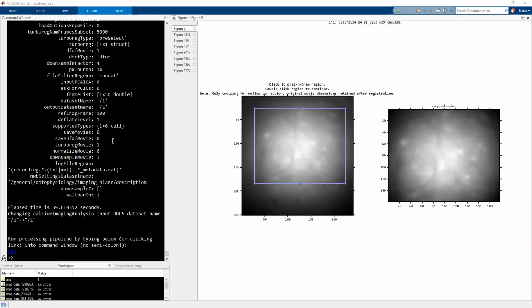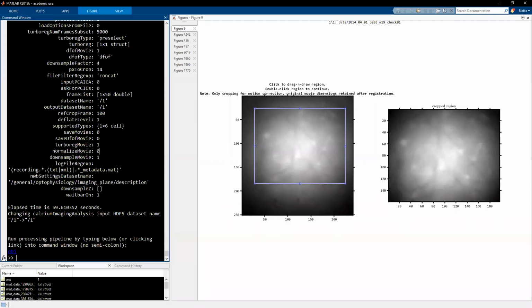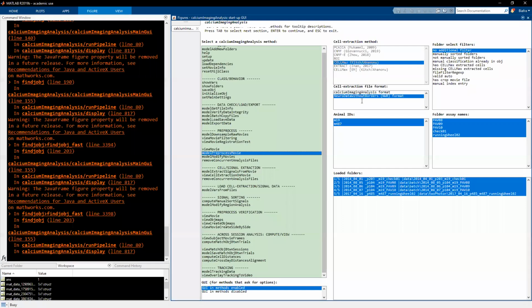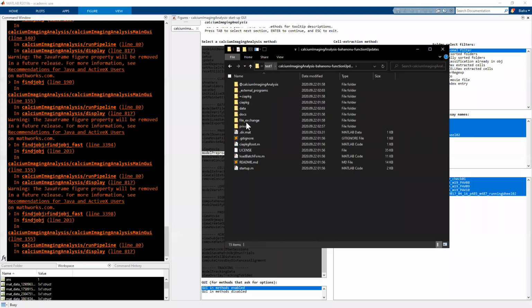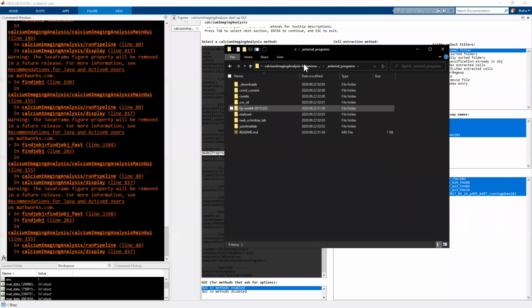Once you've run the pre-processing, what that looks like in terms of the actual output files is this: if you go in and look at the example folder files that you can download, they are put in the data folder. The way this is generally organized is that any of those external repos are all downloaded here. So if you need to modify or change something in those, you can look here, or the zip files will also be here if something goes wrong or is accidentally deleted. And then the different package functions are in either the package or in this underlying folder.